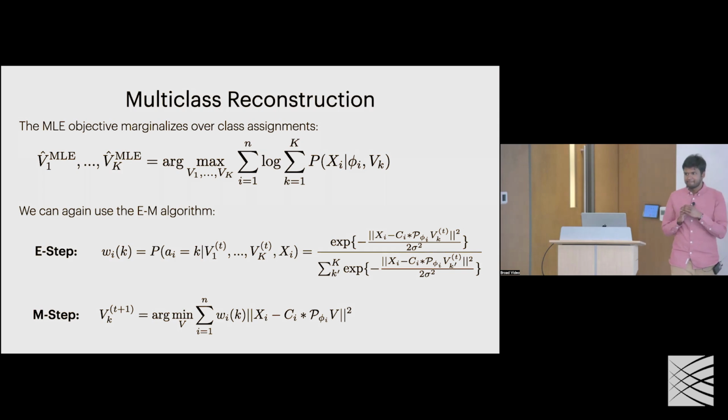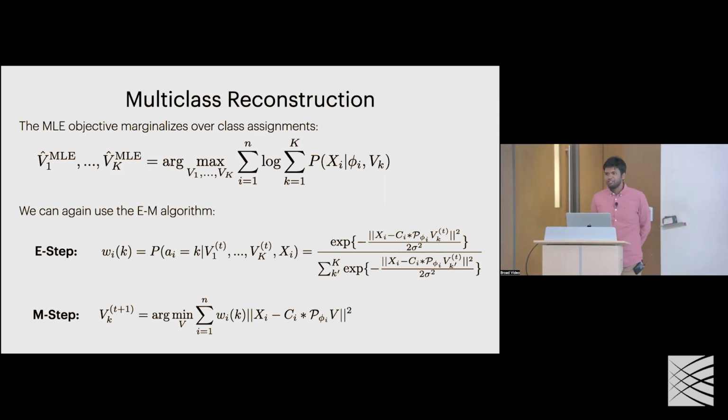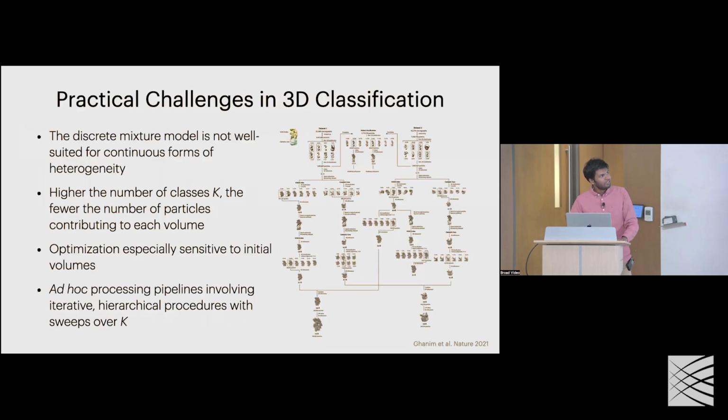Every class, we still have different possible poses though, right? Yes, that is true. In a full formulation, there is a per class pose as well. It sort of depends on the route you take during processing. So there's one route, do a homogeneous first, just use those poses, purely classify. There are other routes where you can do the joint optimization. So yeah, the process is going to look very similar, just doing this optimization over class assignments.